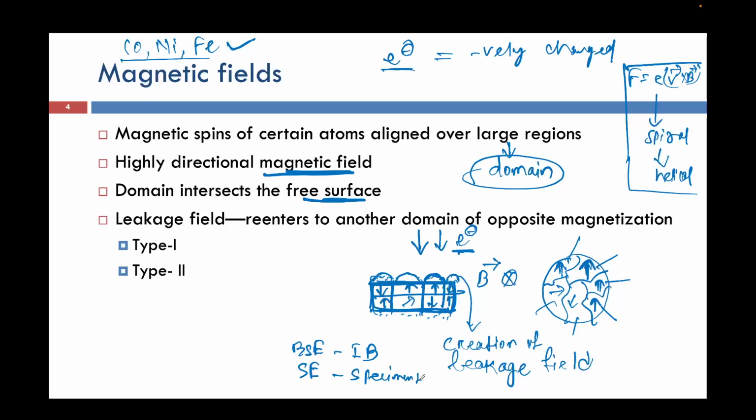So when both of them have different velocity vectors, if I am talking about VAC, here I also have to talk about VBAC. Since both of them have two different velocity vectors, and an electric field and a charged particle are there, the force imparted on them by this magnetic field, or by this leakage magnetic field, will be different. Due to that, the collection by the detector will also vary. That will produce another contrast mechanism, due to this magnetic field.